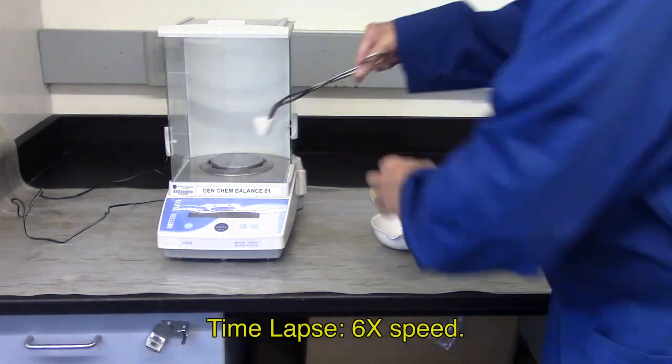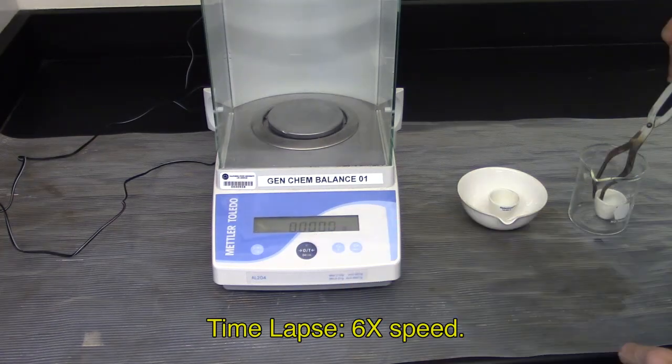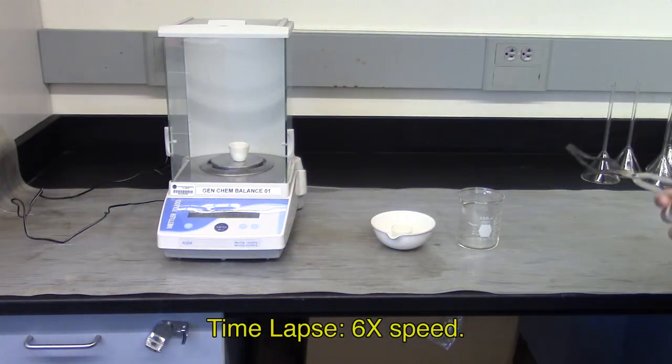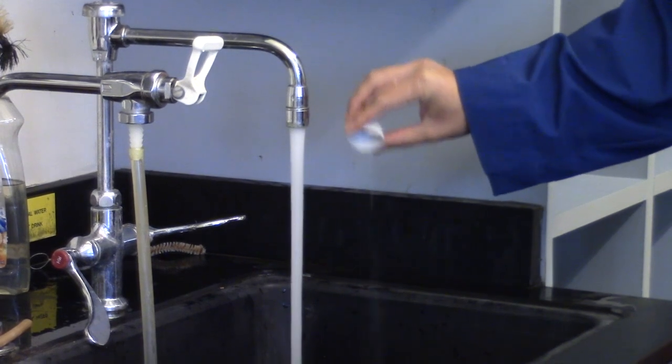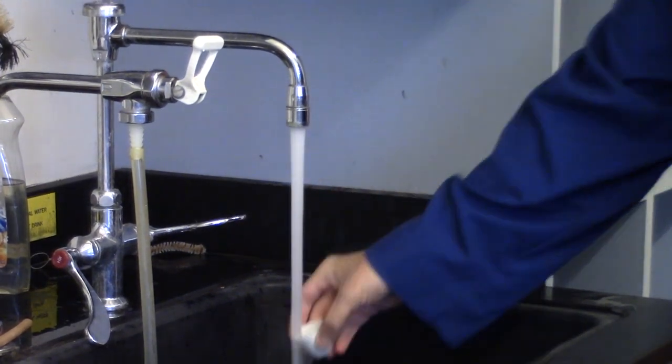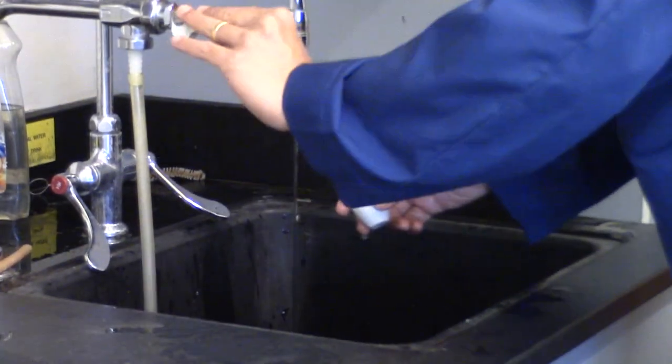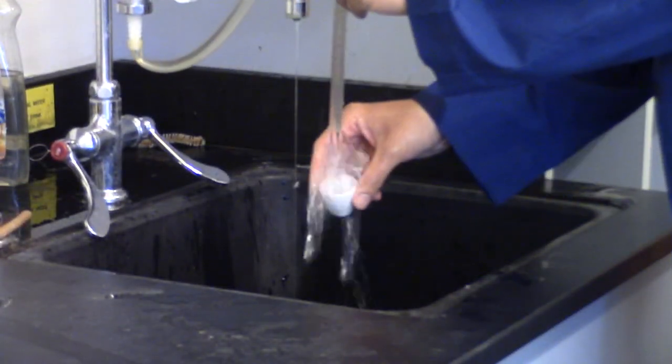Once crucibles are cool enough, weigh each on the same analytical balance. Record the masses. The samples may be disposed of down the drain. Rinse out crucibles well with distilled water.